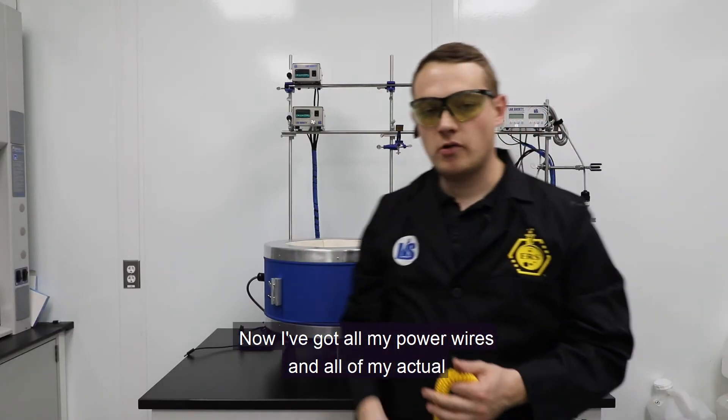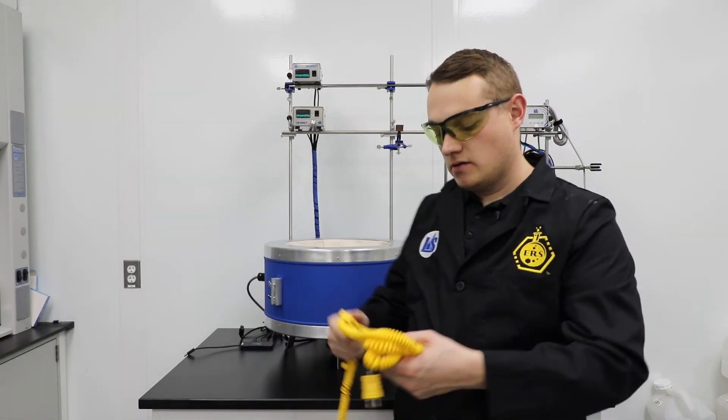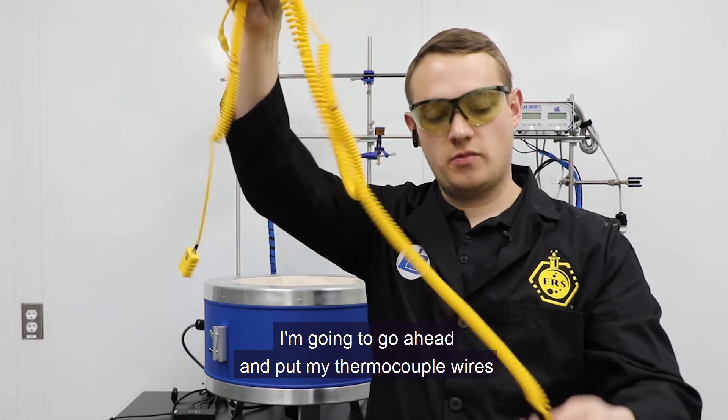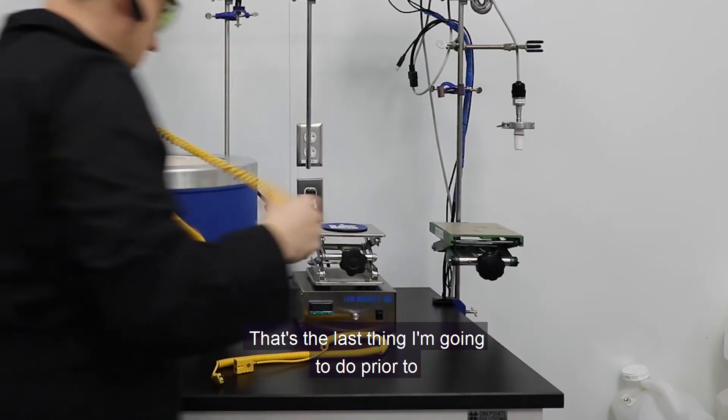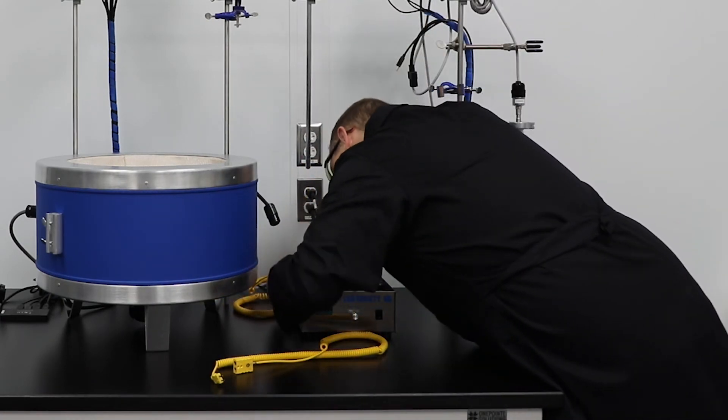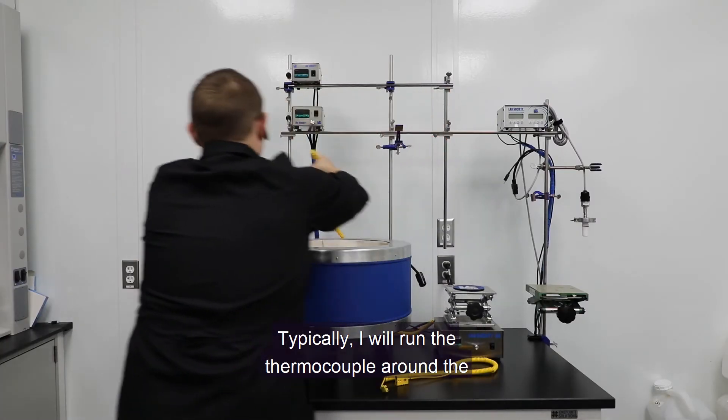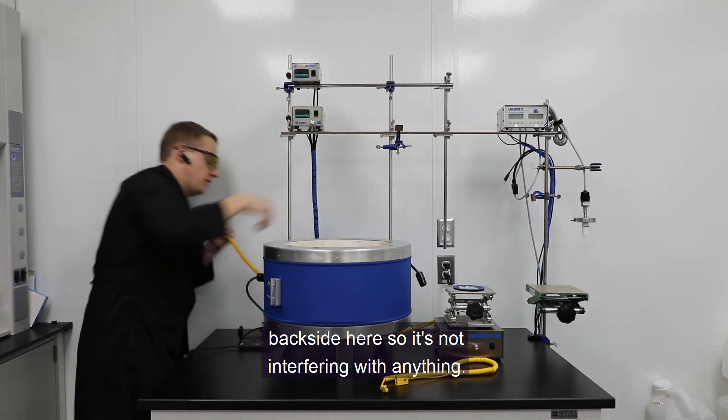Now I've got all my power wires and all of my USB wires in, I'm going to go ahead and put my thermocouple wires in place. So that's the last thing I'm going to do prior to assembling the system. Typically, I will run the thermocouple around the backside here so it's not interfering with anything.